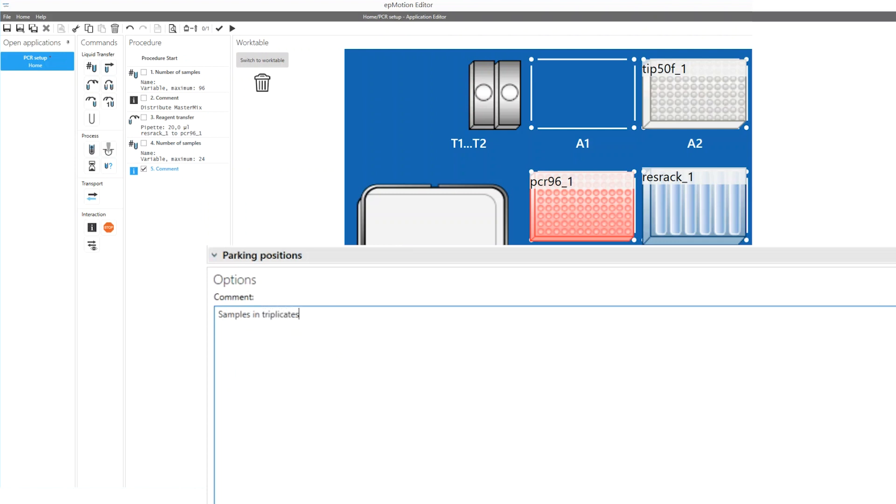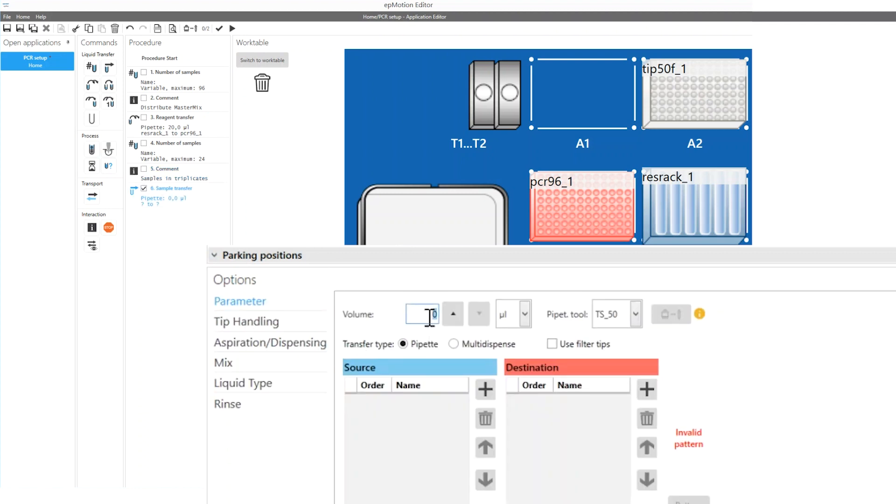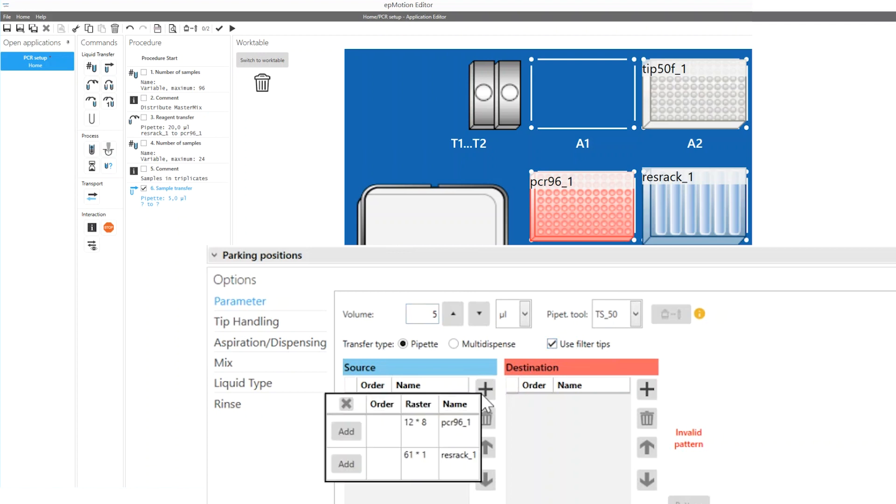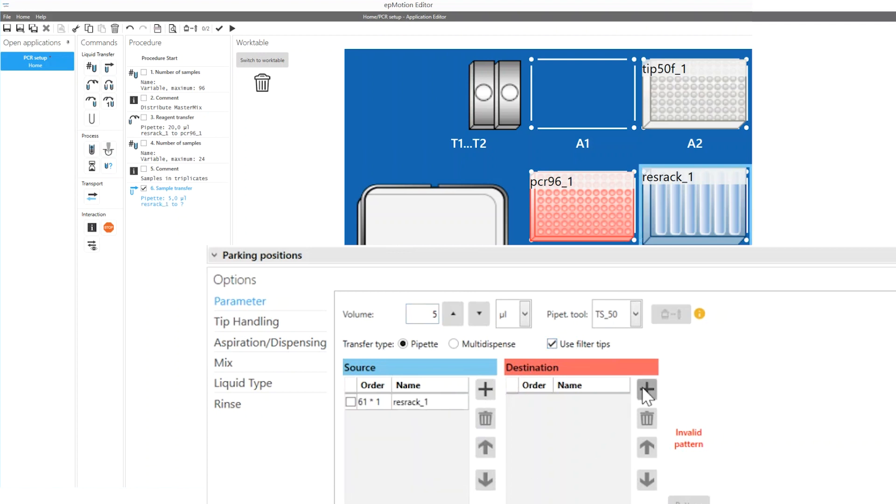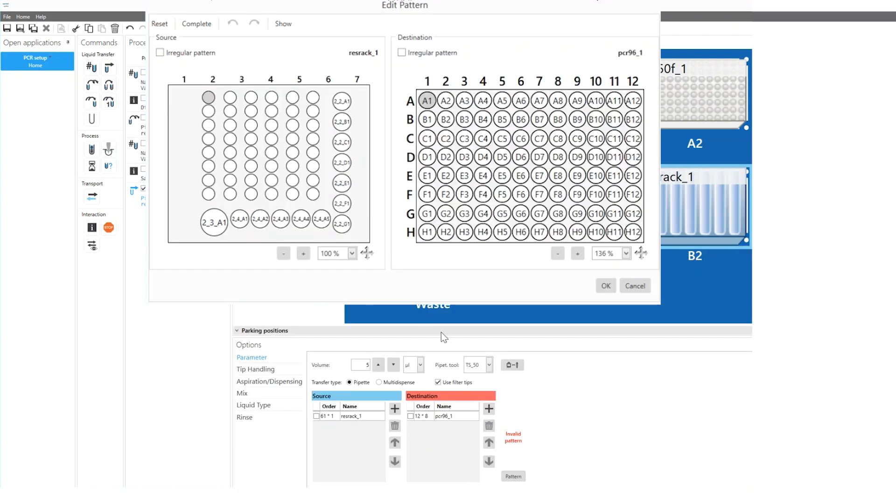A sample transfer command is conducted to transfer samples coming from various source wells into destination wells. After setting the volume, transfer type, tip type and source and destination labware, the pipetting pattern can be defined.